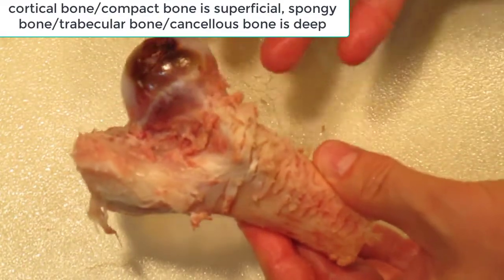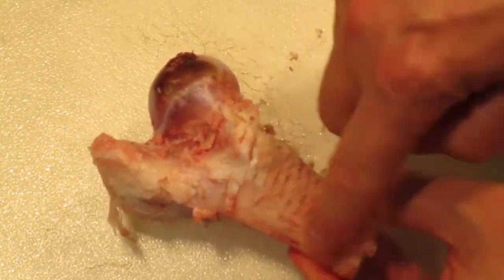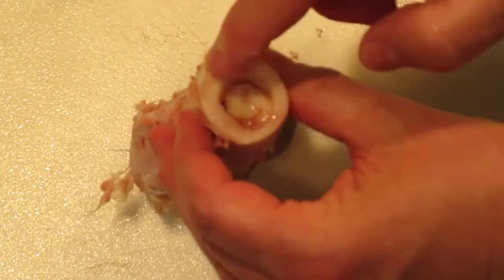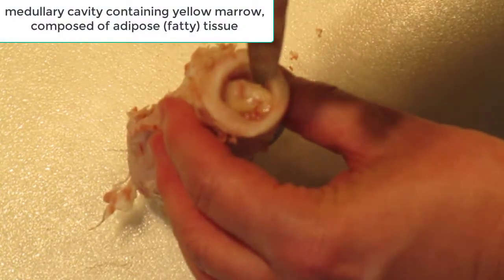This region up here is covered by cortical bone, and inside there is going to be spongy bone — also called trabecular bone or cancellous bone. In the diaphysis region you have just cortical bone, and in the middle is yellow marrow — it's all fatty tissue.